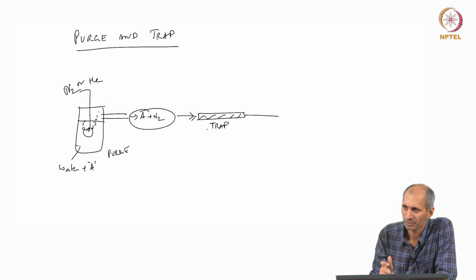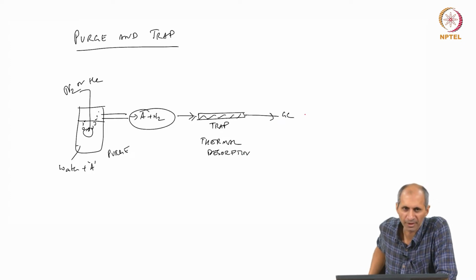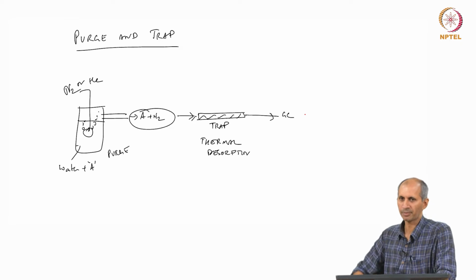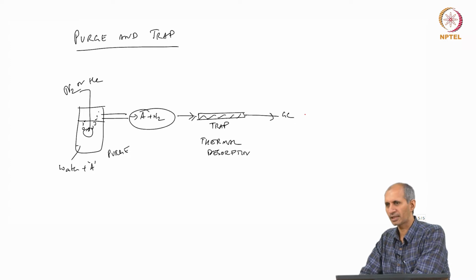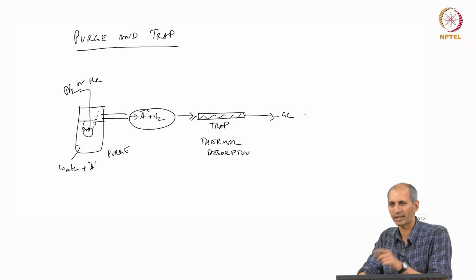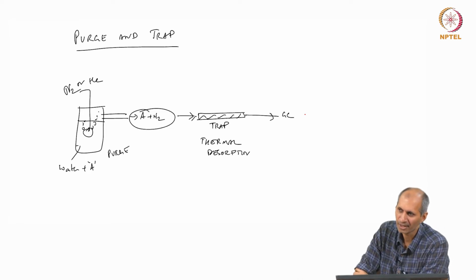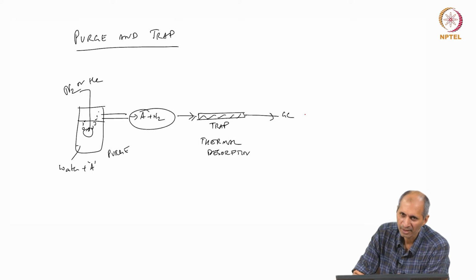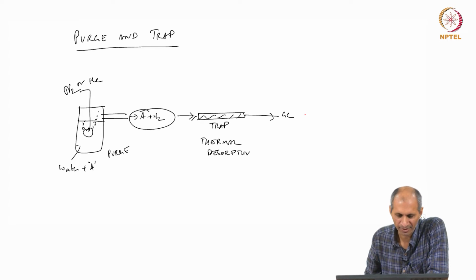Then you do what we did in thermal desorption. You do thermal desorption after that. And then it goes to a GC or a GCMS or whatever through a sampling loop. Again, it has to go through a sample loop to do this. So, these accessories are very useful in analyzing this. All of these are directed towards only one thing: we are trying to increase our confidence in our analysis. So, quality control and quality analysis is the focus in most of the methodologies developed for these kinds of things.